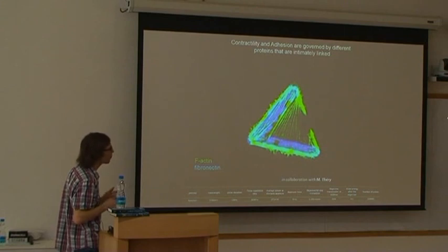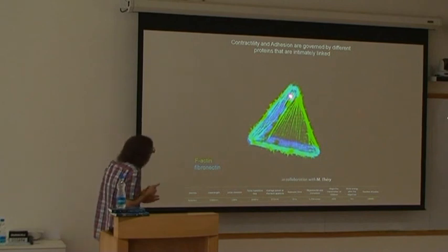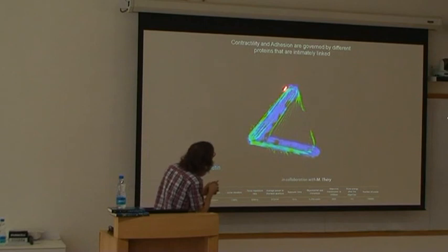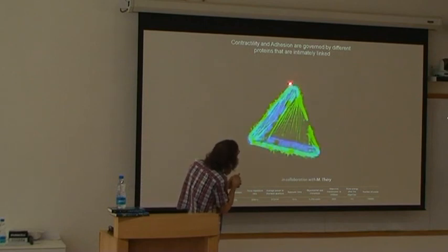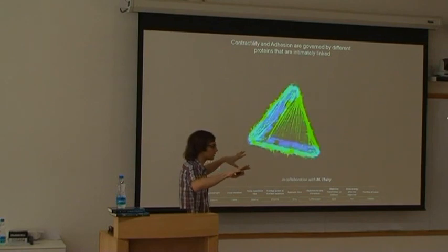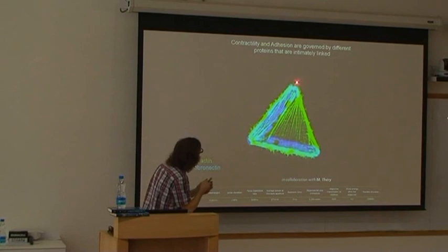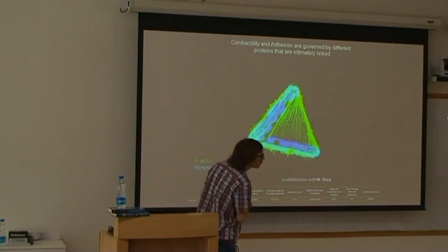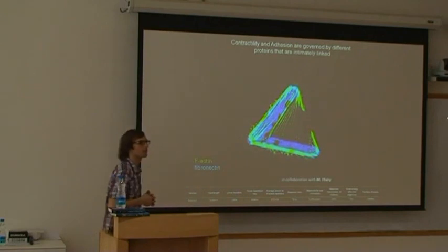I think this was probably the only line he had at the time. So I don't know exactly what happens to the membrane, but I would say the membrane probably would retract too. Here we probably still see a bit of the membrane. Probably the actin retracts, the membrane maybe stays a bit attached. You see, there is some green stuff there still. Probably.